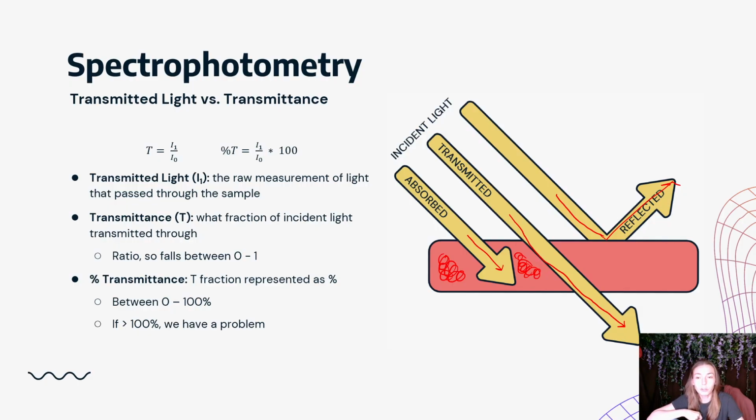It's like, did y'all ever do the buckle challenge in high school when you went to the buckle store and you would go into the store and try to get all the way to the back wall to touch the back wall without an employee stopping you to say hello? That's such a niche reference, but you can think of transmitted light as the buckle challenge, trying to get to the back of the buckle store before an employee stopped you to say hi. The more employees that were there, the higher the concentration of the analyte. The more employees that were there, the harder it was to make it to the back of the store and touch the back wall and win the challenge, right? Transmitted light wins the challenge in this instance.